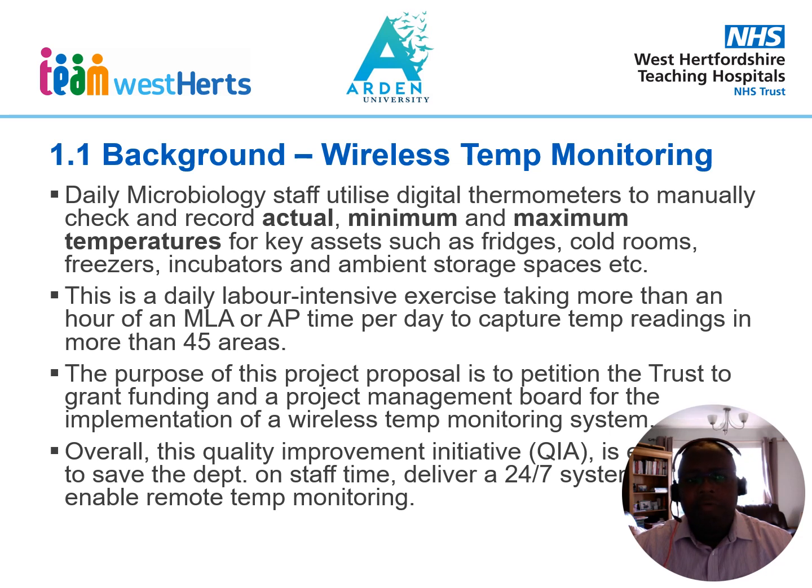Daily, microbiology staff utilize digital thermometers to manually check and record actual, minimum and maximum temperatures. This is a labor intensive exercise, and it takes on average more than an hour for a medical laboratory assistant or an associate practitioner to capture temperature readings in more than 45 areas. So this project proposal is to petition the trust to grant funding and a project management board for the implementation of a wireless temperature monitoring system.